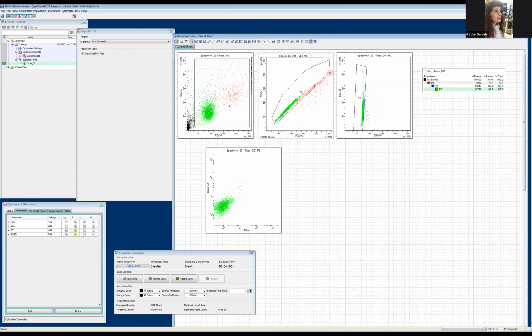If I start including this, you might be able to start seeing very clearly here, like Derek mentioned, exploring your data, getting intimate with it. You can see very clearly that those are the aggregates, okay? And you can confirm the gating that you're using with another parameter like side scatter. That's why it's so nice to have that double doublet exclusion, because as you're going through, maybe you include this and think that's correct, but it's actually aggregates of cells. And that's something that experience will tell you.